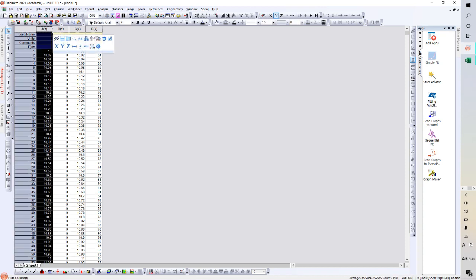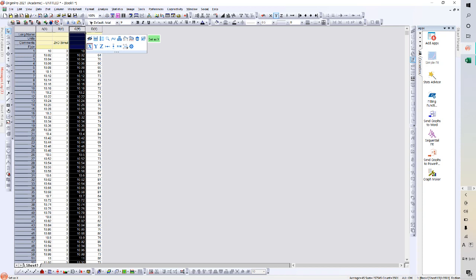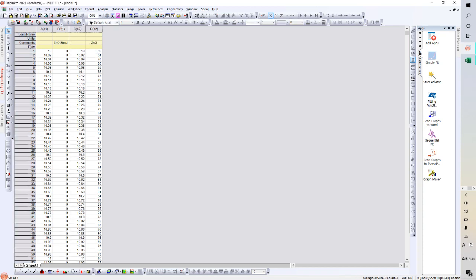If you just ordinarily tap at the top, this symbol will appear. And if you click this, this will change into the x-axis. And if you click this as well, it'll change into the x2 axis. So this is it for now.